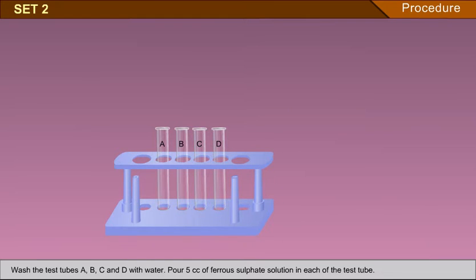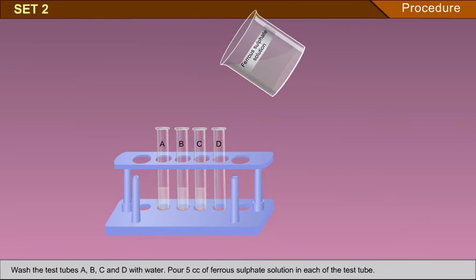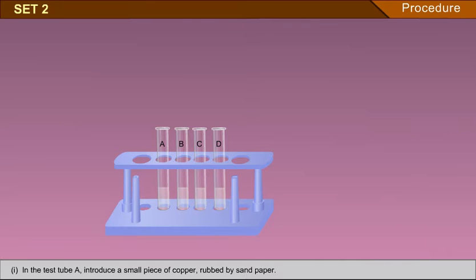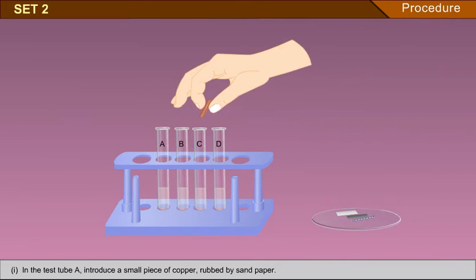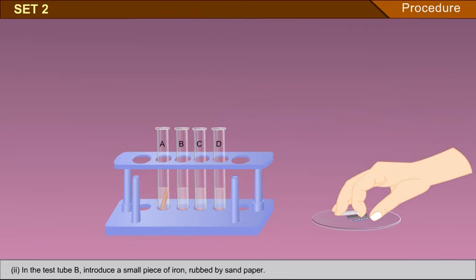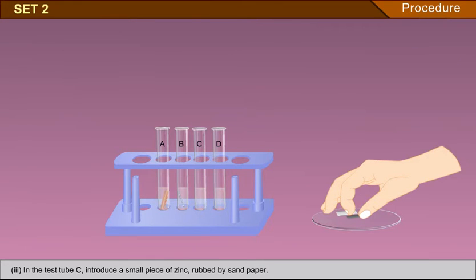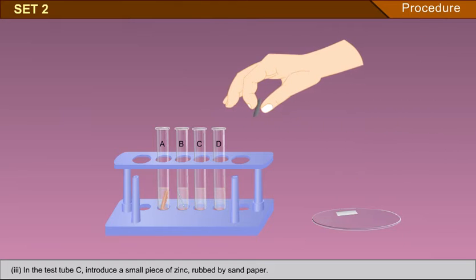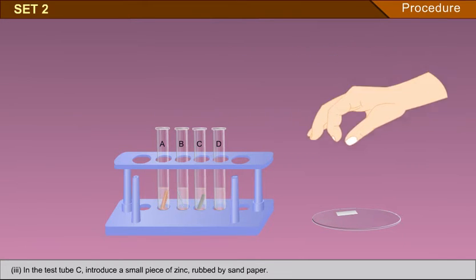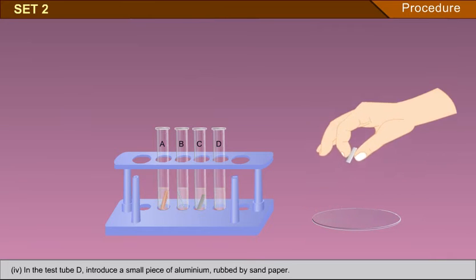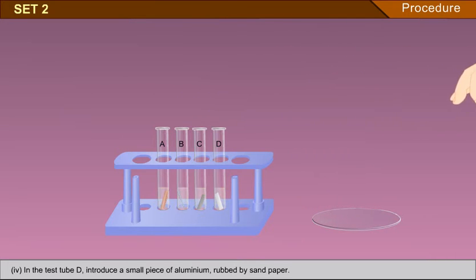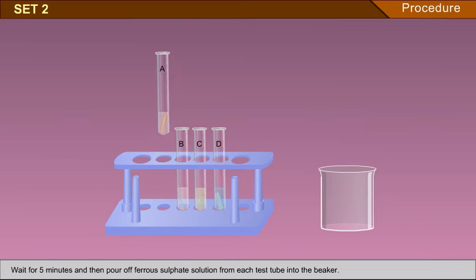Set 2: Wash the test tubes A, B, C and D with water. Pour 5 cc of ferrous sulphate solution in each test tube. In test tube A, introduce a small piece of copper rubbed by sandpaper. In test tube B, introduce a small piece of iron rubbed by sandpaper. In test tube C, introduce a small piece of zinc rubbed by sandpaper. In test tube D, introduce a small piece of aluminium rubbed by sandpaper. Wait for 5 minutes and then pour off ferrous sulphate solution from each test tube into the beaker.